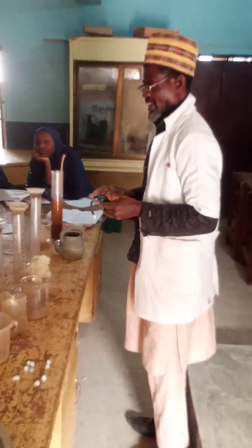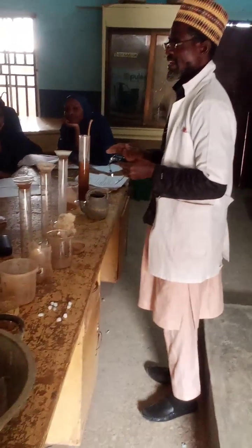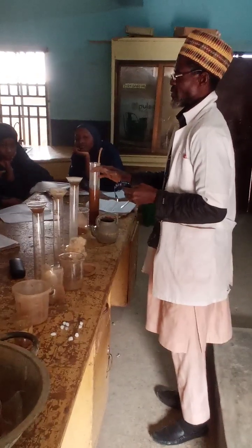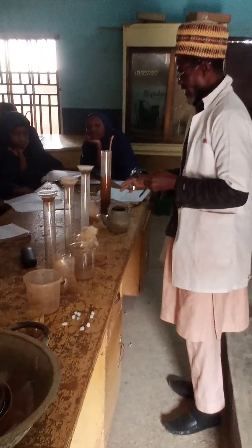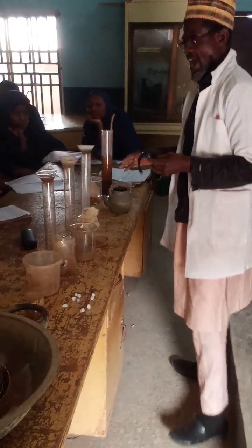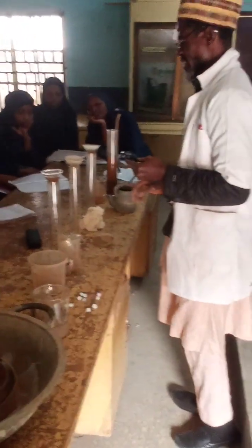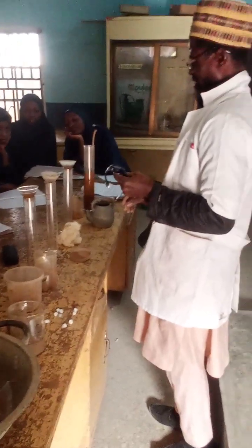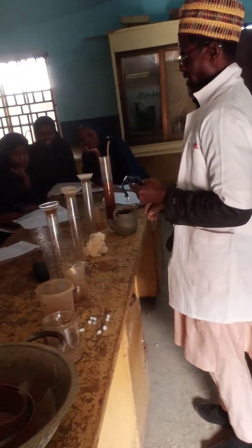Is that clear? You can see immediately we added water, a particular soil sample, the water began to drain out immediately. You can see. In the other two, you have not yet observed the drainage of the water.